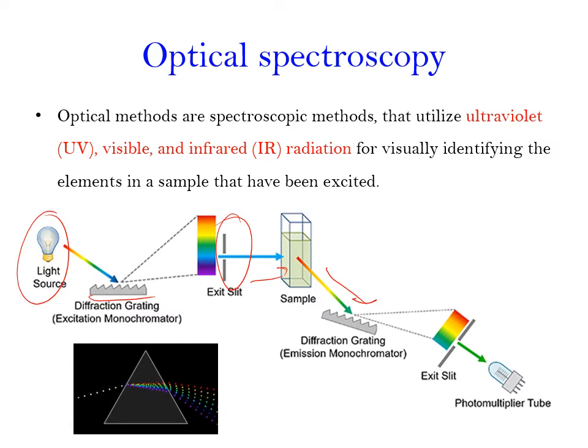applied to the diffraction grating, because that specific wavelength light could be the cause of different wavelengths, because the molecule or the sample can scatter light, as either scattering or reflection or absorption could occur in that molecule, and there could be a change in frequency.